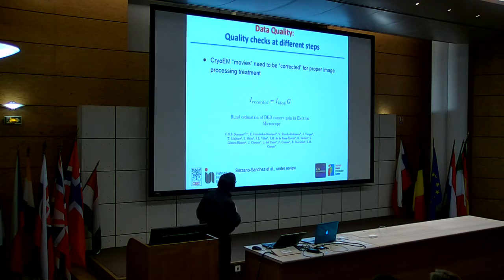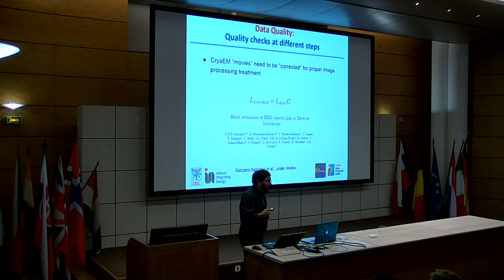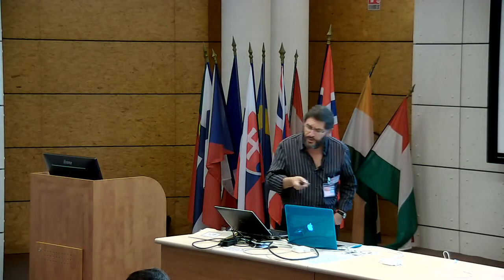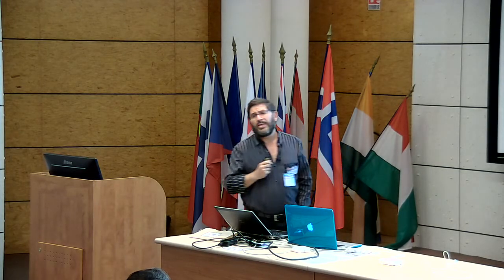Well, in an extremely simplified way, that is actually the way we treat the images, in a very simple linear approximation of understanding the image or the video that you are recording at the microscope. Your recorded video is going to be related to your ideal video, in the most simple of the models, by a gain image.